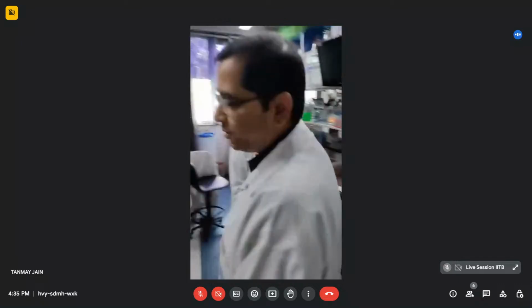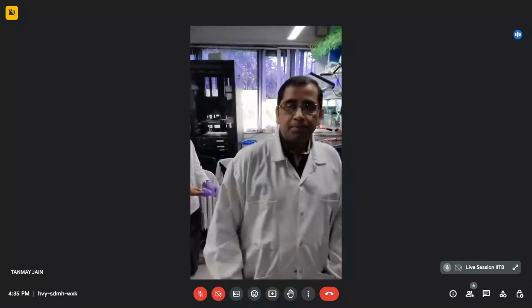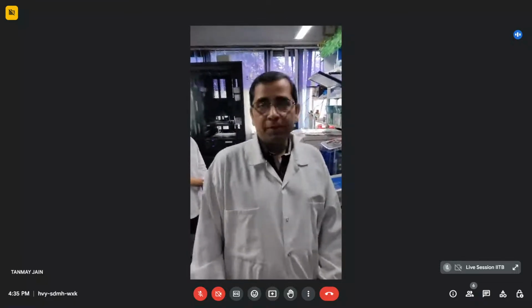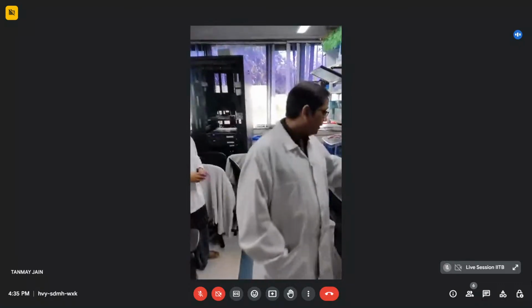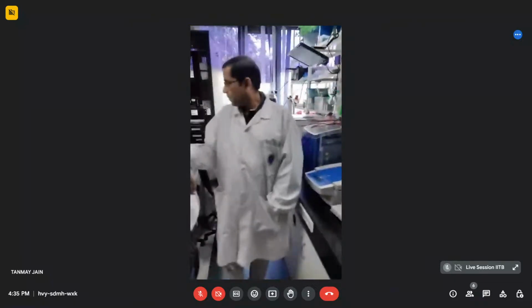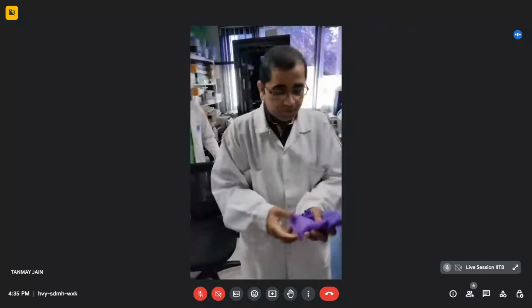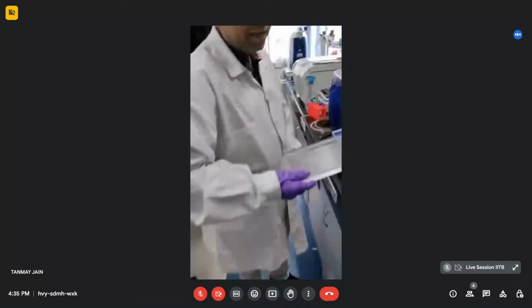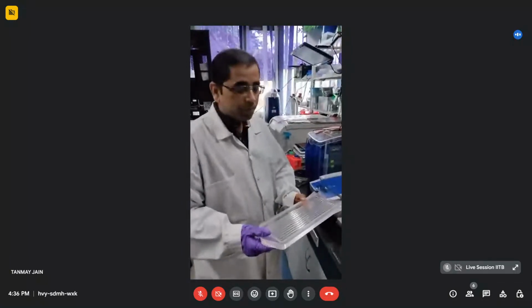All right. So since I've already talked about the SDS-PAGE, I can take it from here, and further separation of the complex proteome could be done based on the 2D electrophoresis, which we are talking about. The same setup can be used here, but we first have to utilize isoelectric focusing, IEF. So I think what is kept here is the setup for the rehydration for the isoelectric focusing, which we will do with the IPG strip.